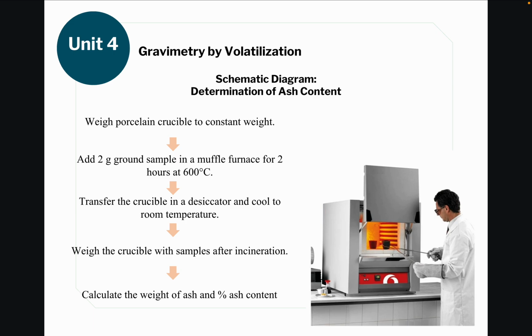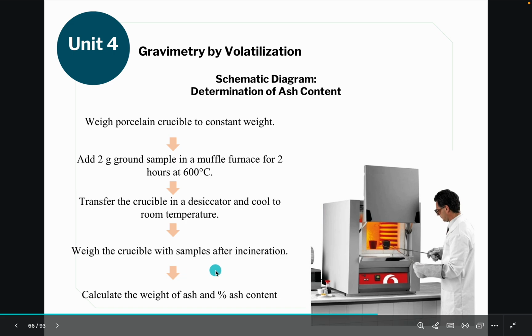Then after the vaporization of these volatile substances, they're already out of your sample, so you can get the mass and measure it using the analytical balance here.